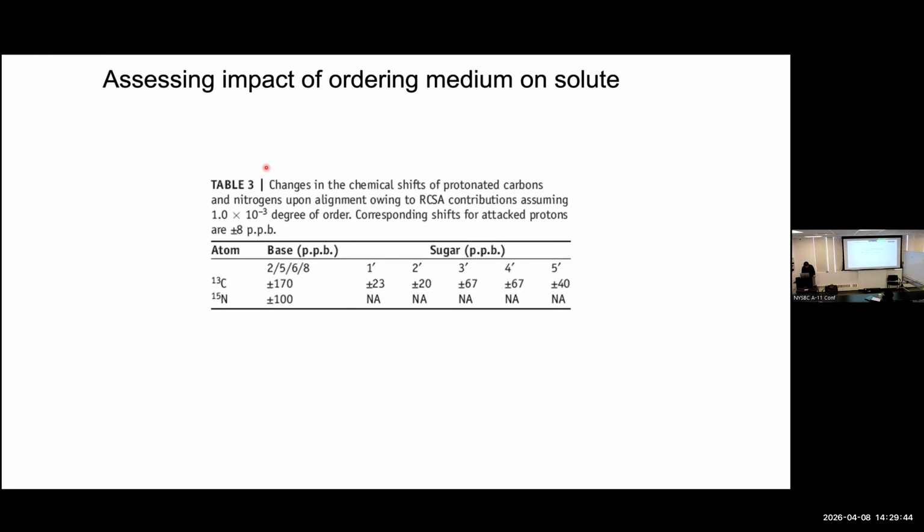Okay. So now, as I mentioned, you should still always be paranoid if you're going to measure these RDCs: what if my RNA loves phage and it's binding? So what would you do, obviously, in solution NMR to check that something is perturbing your sample? What's the obvious thing you do? Check the chemical shift, right? And you say, oh, if my chemical shifts are changing, then maybe there's an interaction happening, or maybe my buffer is off.